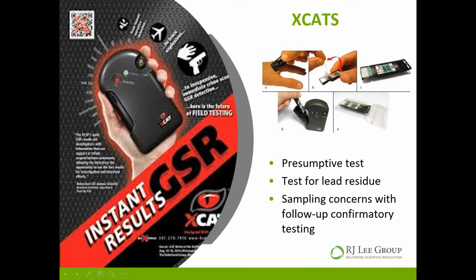The problem is once we pull that adhesive off of that pad, half of that pad comes with the adhesive and we lose the area that we were going to analyze to begin with. So my bottom line answer is it's much better for you just to do an SEM kit in the beginning and not go through the whole presumptive testing of it.